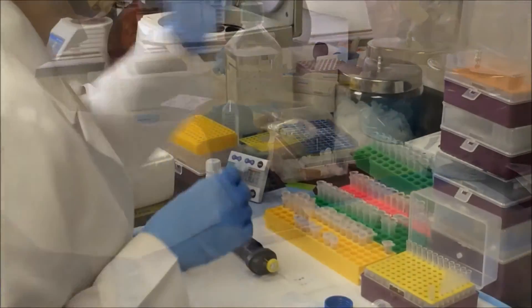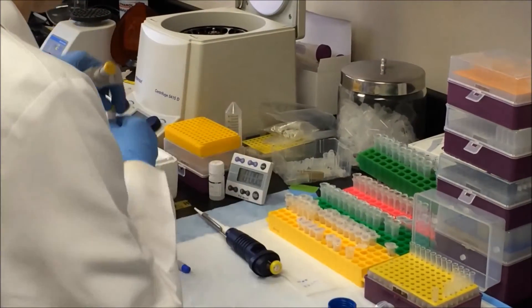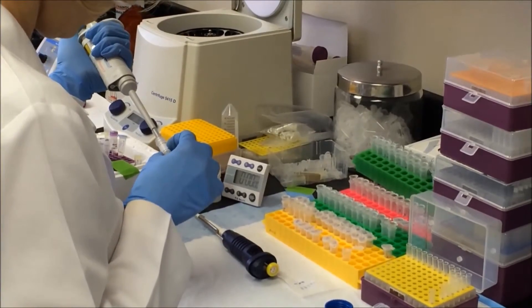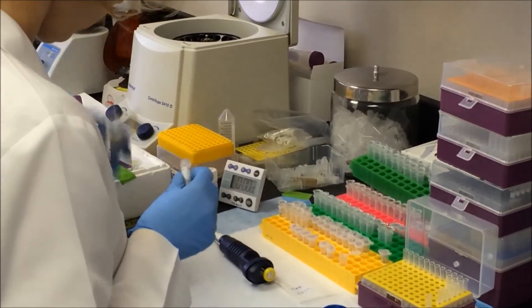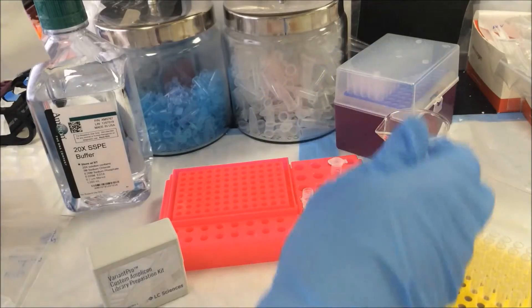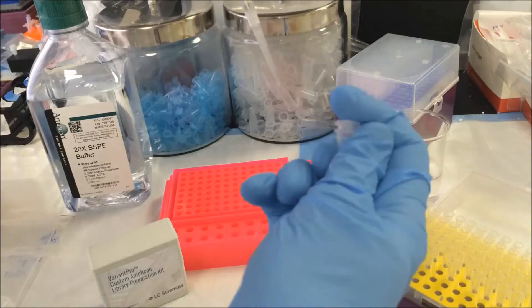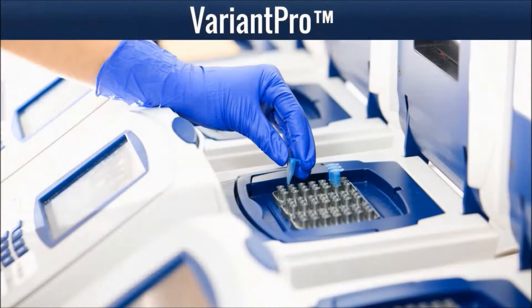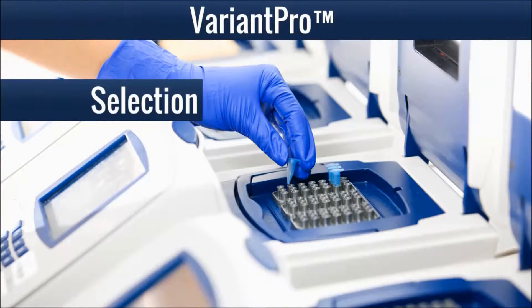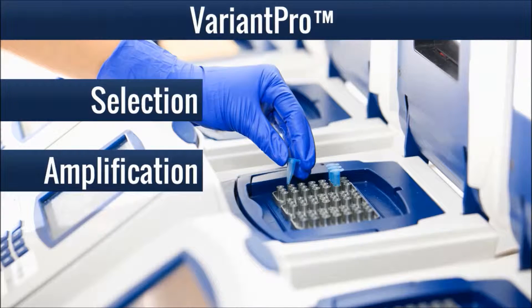A single pair of common primers and a mixture of multiple pairs of specific primers are added to a genomic DNA sample in a single tube. This comprises the entire hands-on procedure required to perform relay PCR. Both a selection phase, where the genomic targets of interest are captured, and a library amplification phase will occur during this single PCR reaction.